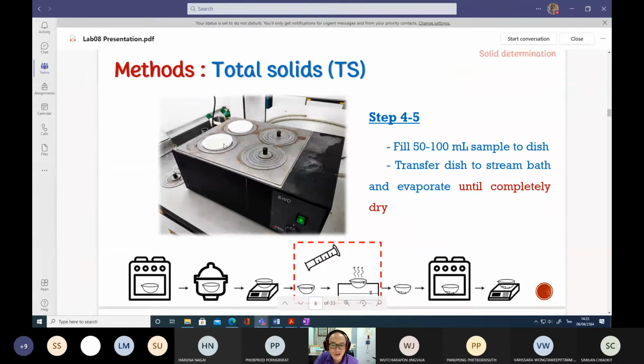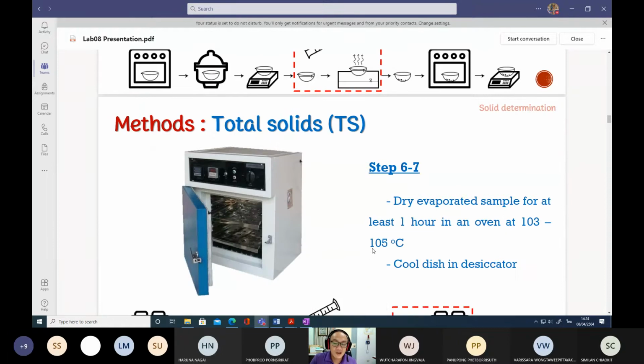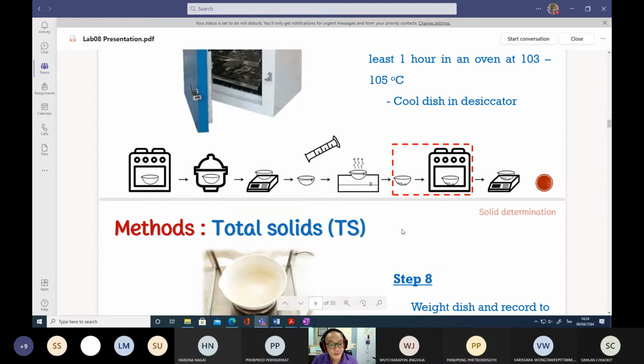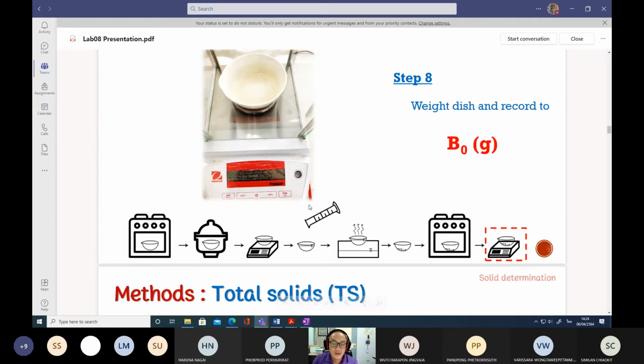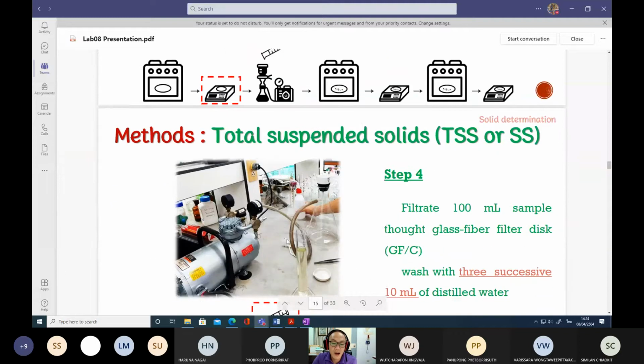So we put the crucibles here, and then we set the temperature to 100 degrees Celsius, so we boil the water. Steam will actually be released from this water bath, and once it releases the heat, the water inside can also be brought out. So this is a kind of water bath. For the solids, we can use the oven at a temperature between 103 and 105 degrees Celsius, with the analytical balance and so on. So this one is the suction pump.